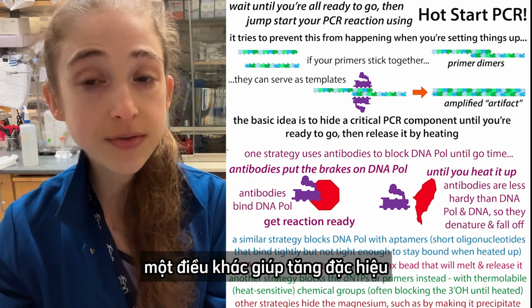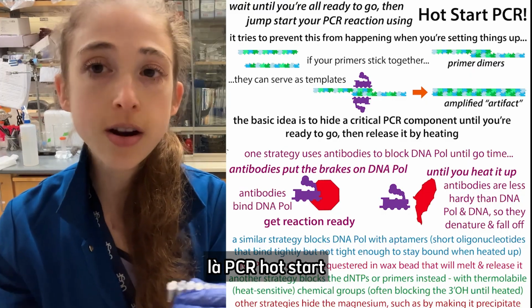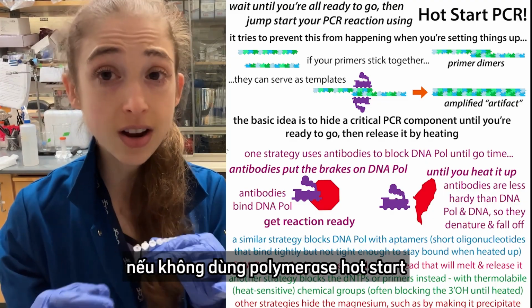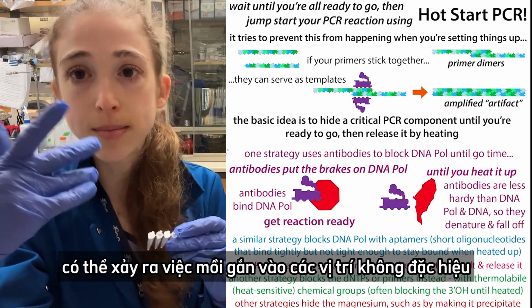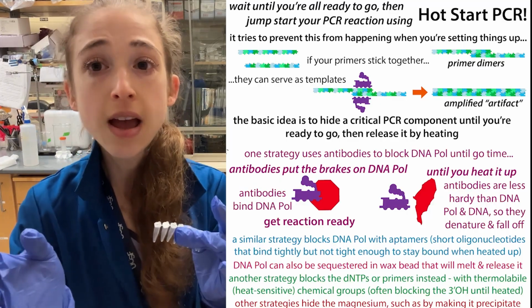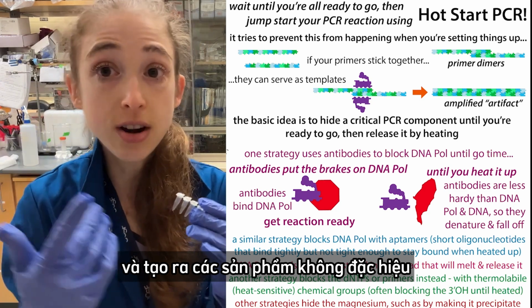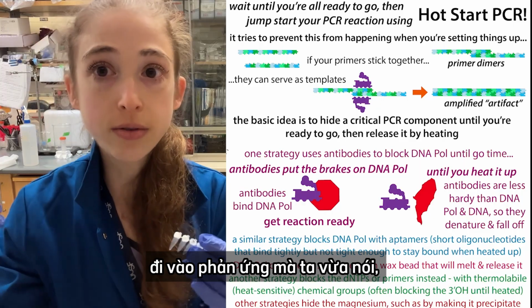Something else that can help with specificity and that involves heat is hot start PCR. Basically, this is a polymerase that's blocked until it gets heated. So when you're setting up your PCR reaction, if you're not using a hot start polymerase, you can get primers binding to non-specific sites, and then if the polymerase is able to be active at that lower temperature, even if it's not its ideal temperature, maybe it can still start going. And it can start making those non-specific products, and then you have a bunch of non-specific products going into your reaction.